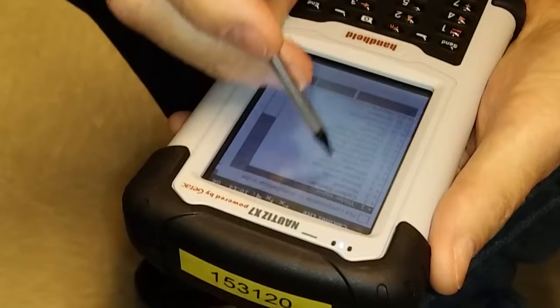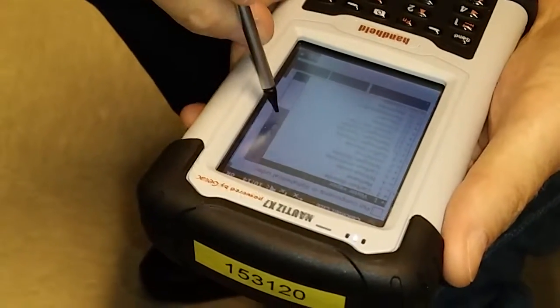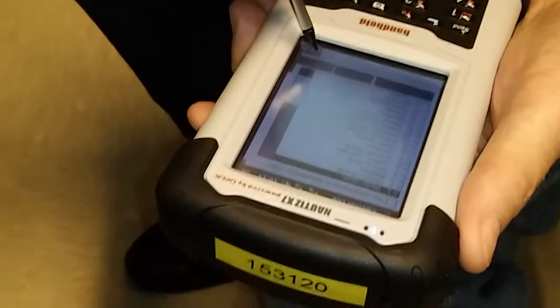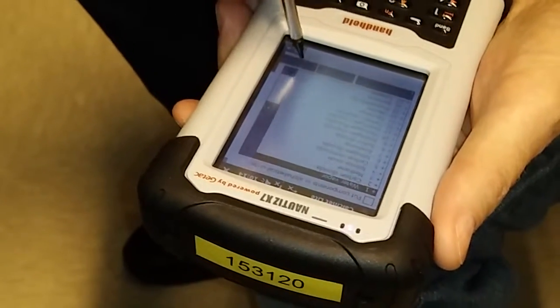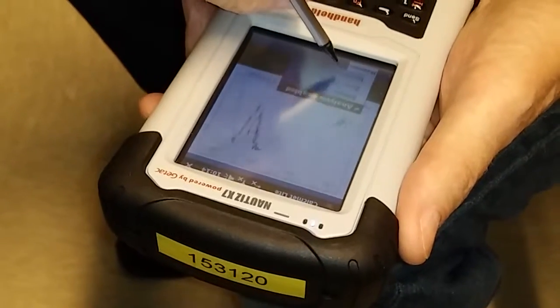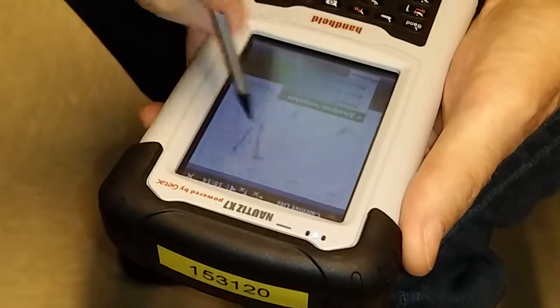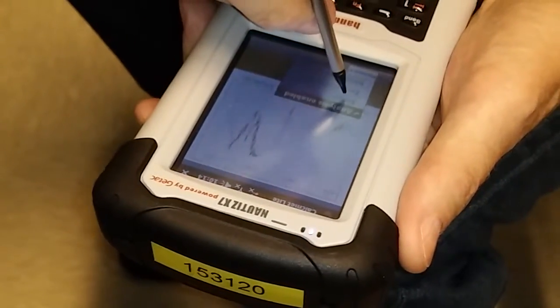Here you can apparently select certain items to analyze for. I'll cancel that. But the measuring part, if I hit single, it'll do a single measurement, but I don't hear the fan going.